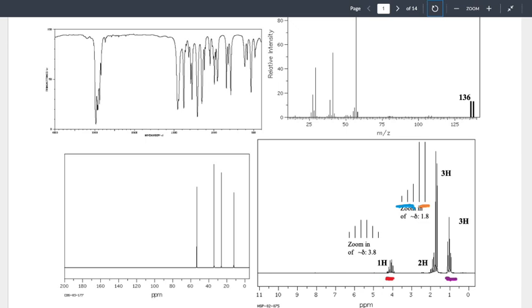I would argue it's the same reason that Joshua wanted me to put a C initially. We've referenced the formula enough that you're like, I know it's got to be carbons. I understand that. That's okay. You can make that shift to a C. Perfectly acceptable in this case. Again, I would lean more towards the question mark because I still don't know for certain.